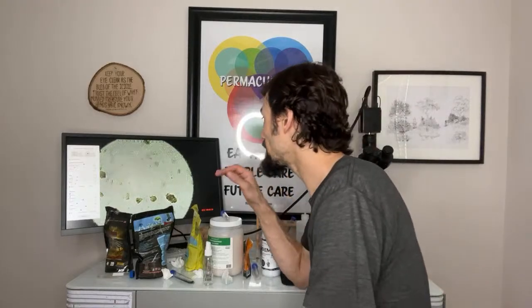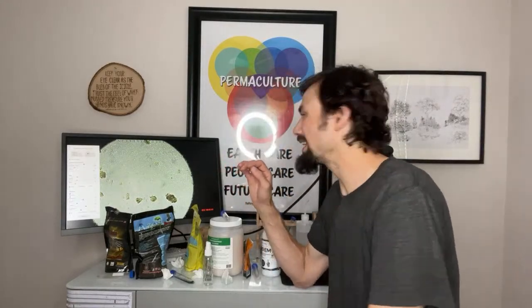We could even do the oil lens on this and go really close to 1000x, and they'd still be tiny. And there'd be tinier things we'd see wiggling in the distance. And that's the crazy thing, we don't know how small is and how small gets. There's actually a gap. We have tools, right? Over time, we've developed different tools that will see in different frequencies of light, different depths of magnification. And we went to the limit of resolution with the microscope. That's what 1000x is. And then we went further with the electron microscope, right? So it's this constant process, but there's actually a gap between them.